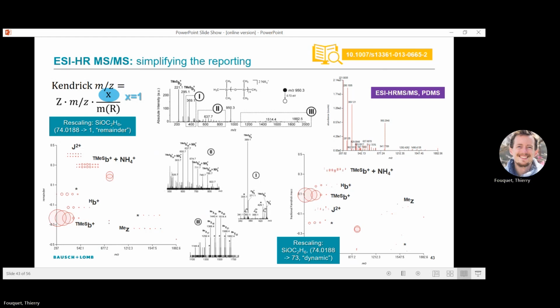Because of such an extreme rescaling, the points are spread so much along the y-axis and then folded step by step, which leads to these straight lines. It's a nice way to visually realign points when you have a lack of accuracy and resolution in your data in the normal plot.